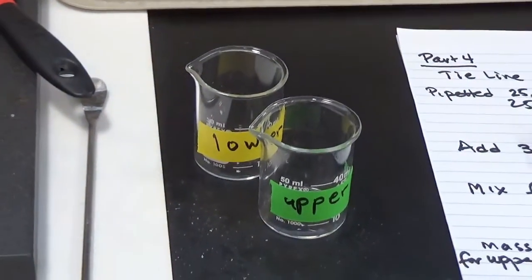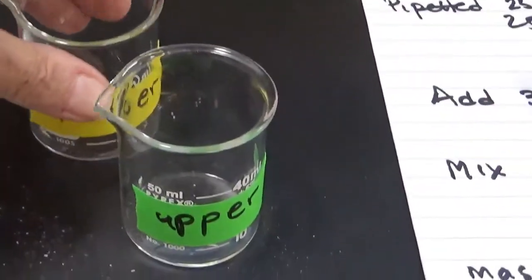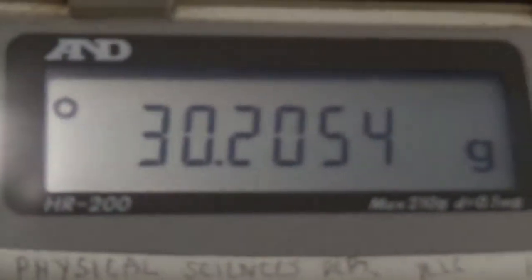So now what I'm going to do is find the mass of the beakers that I'm going to put the lower and upper layers in. So I've zeroed out the balance, and the mass of the beaker that I'm going to put the lower layer in is 30.2054. So that's for the lower layer.